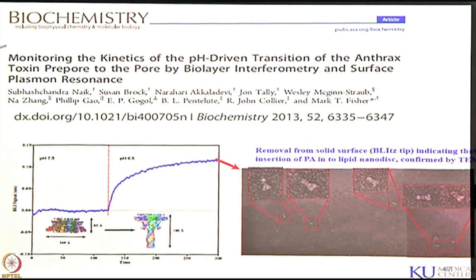Because when it comes to SPR, when you elute the complex mixture and collect that, your sample is more diluted, so you have to concentrate it before you perform the further studies. You can enrich it by dipping in the well itself here.